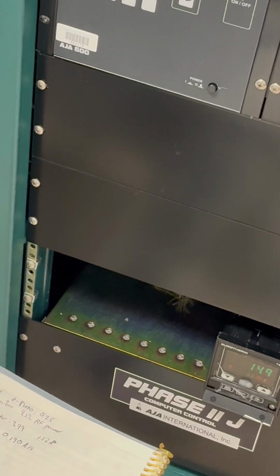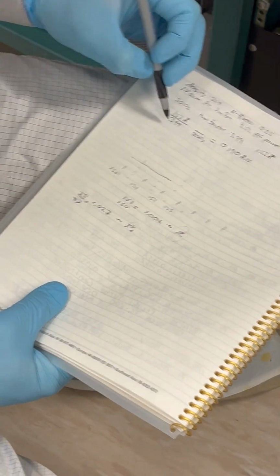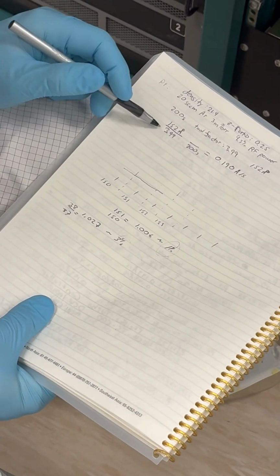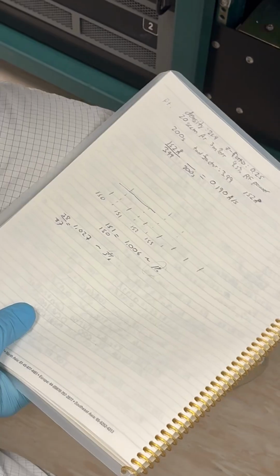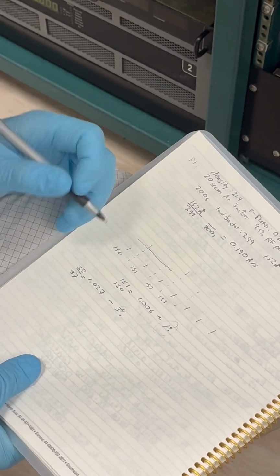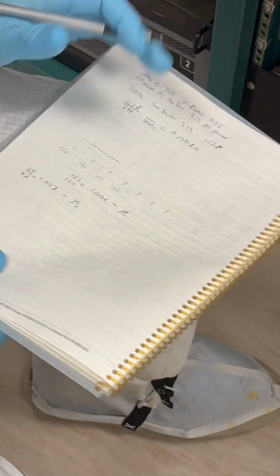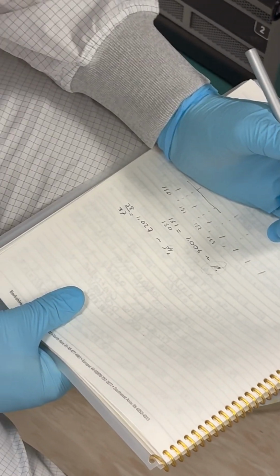But I use this tooling factor so that this number, because normally if this was a 1, it would be that 38 number. All I did was use a tooling factor to multiply the number to get a bigger number, so there's more accuracy in the difference between that number and the one right before it and the one right after it. And then I divide back by the tooling factor to get rid of the issue. Does that make sense? It's just a trick, a tool, a skill. Make sense?